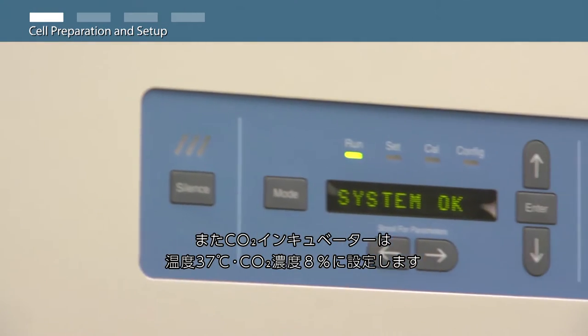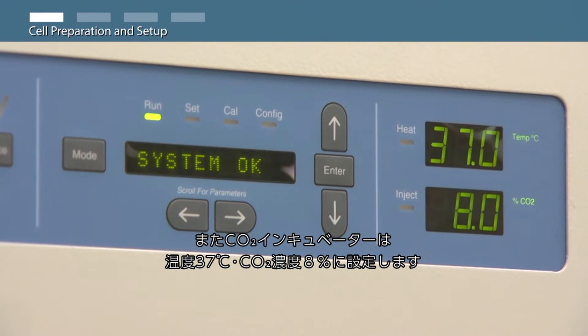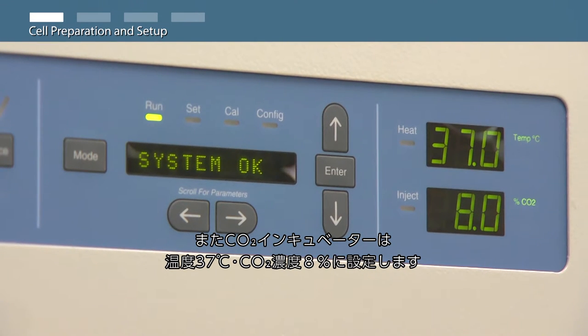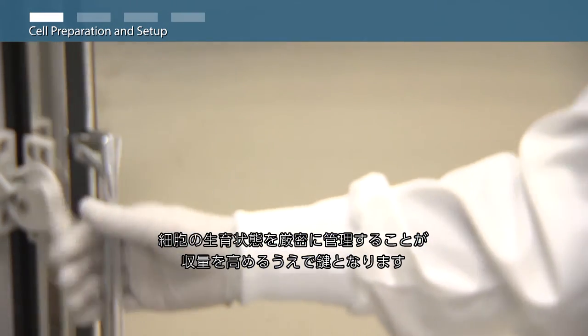Cell culture incubators should be set at 37 degrees Celsius with a humidified atmosphere of 8% carbon dioxide. For routine cell culture maintenance, cell health is critical to maximal performance.